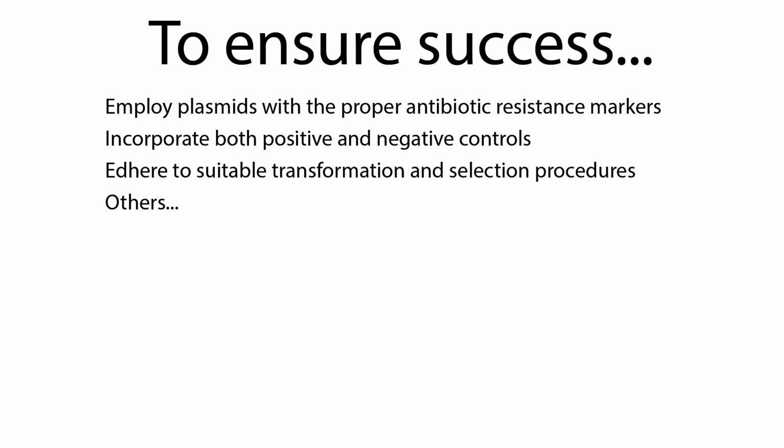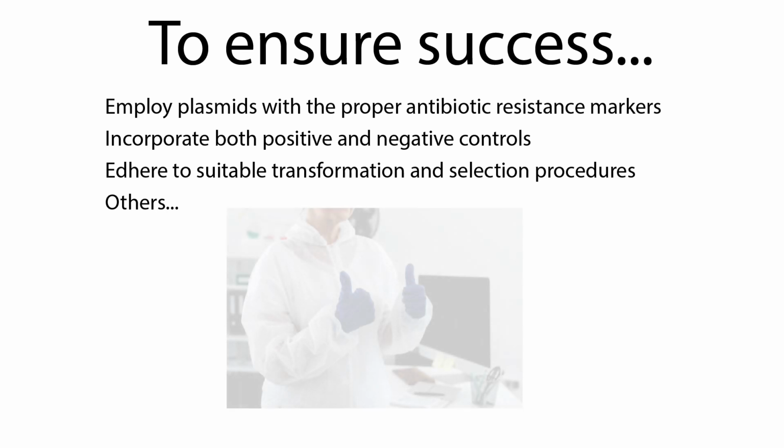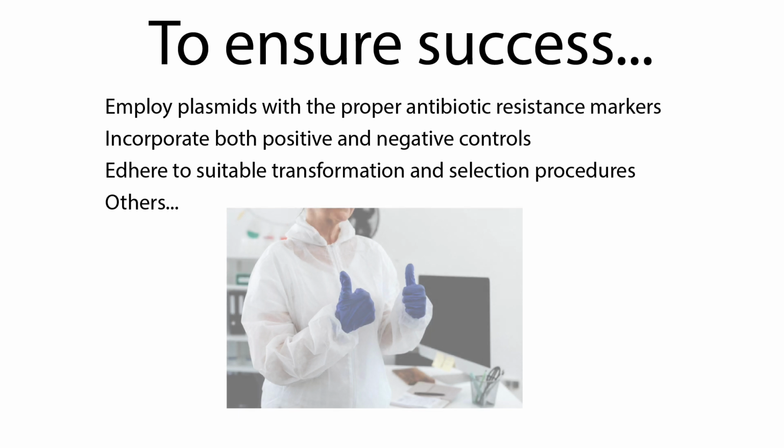However, to ensure the selection and survival of the intended constructs, you should employ plasmids with the proper antibiotic resistance markers during the assembly process. Incorporating both positive and negative controls, adhering to suitable transformation and selection procedures, and other factors will also aid in validating the assembly and achieving the intended results.